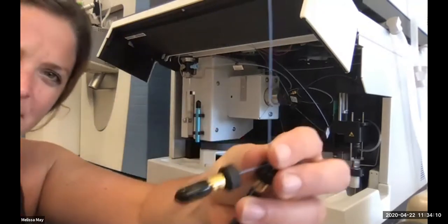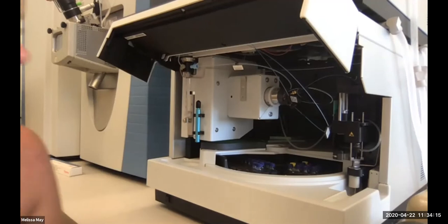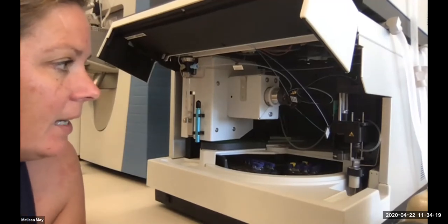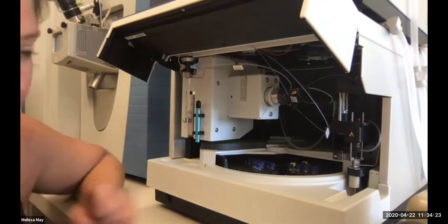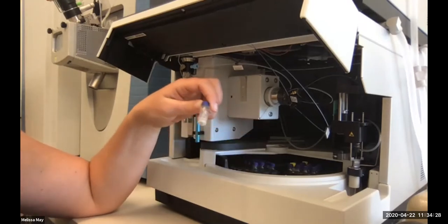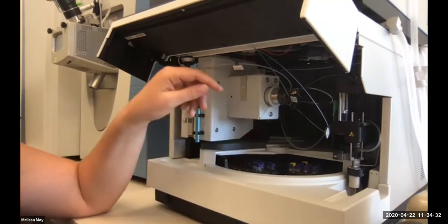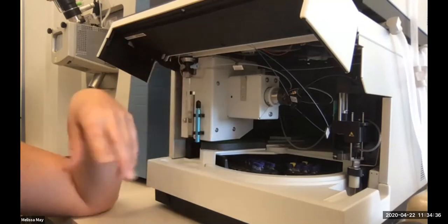Like it's smaller in diameter than this, right? So it's very, very tiny, very delicate. And so we need to be careful about protecting it. And so when we're in our settings and going through the puncture depth, again, it's gonna tell it how far down is your sample in these little teeny vials. So these are our sample vials, so the needle doesn't jam itself into the bottom and damage itself.